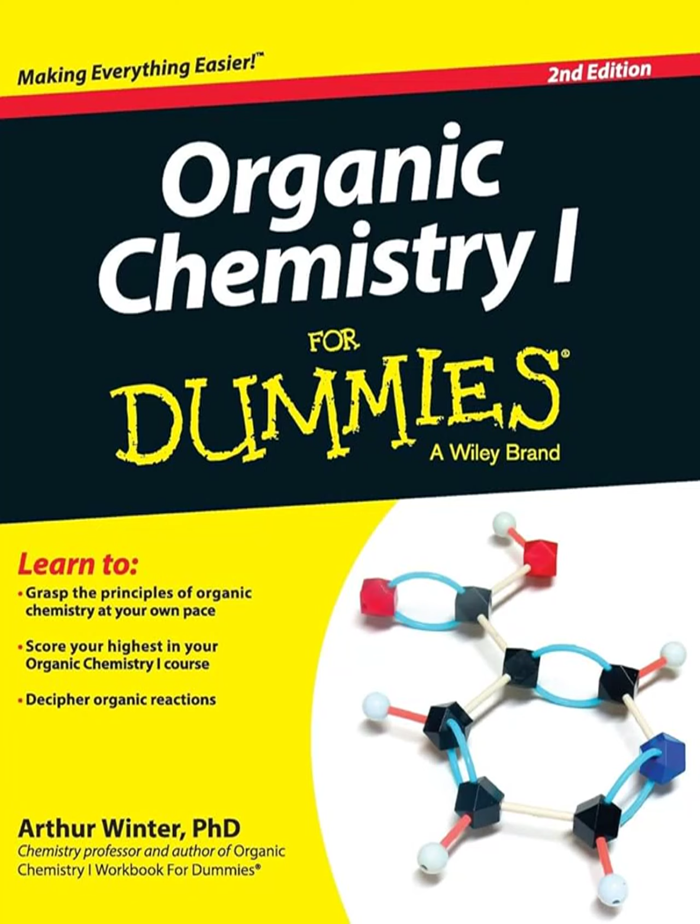First up, clue 1. Determine the degrees of unsaturation, or DOU, from the molecular formula. If you have the formula, that is. Right, if you have it, this is your crucial first step. There's a formula for it you can look up, pretty simple. Number of carbons x 2 plus 2, minus the number of hydrogens, divided by 2. But what it tells us is the powerful part. It reveals how many double bonds or triple bonds or rings must be in the compound. Each double bond or ring counts as 1 degree of unsaturation. A triple bond counts as 2.